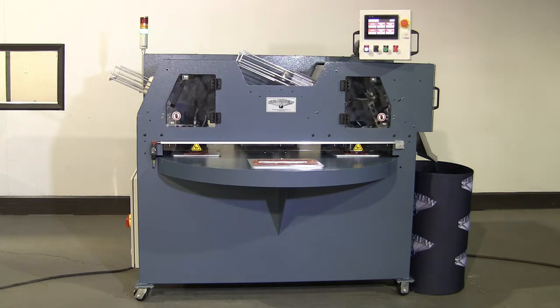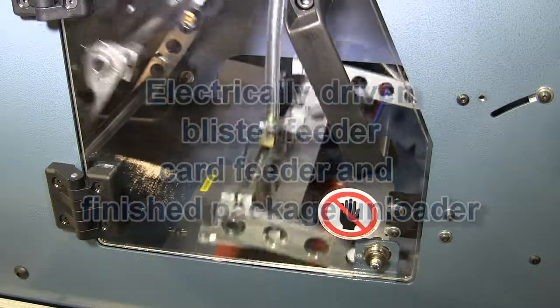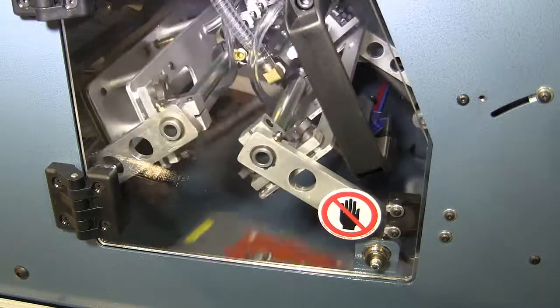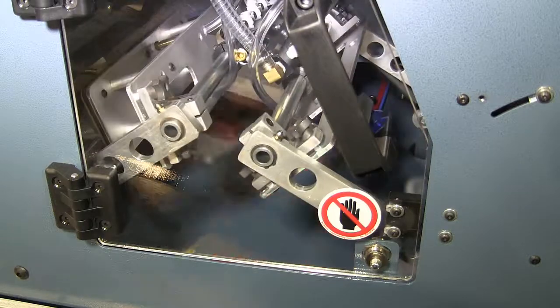Models are available with nominal sealing areas of 10 by 12 inches or 12 by 16 inches. Right hand or left hand finish package discharge is offered.